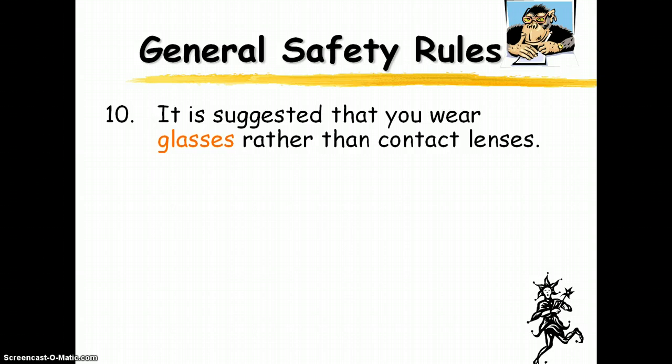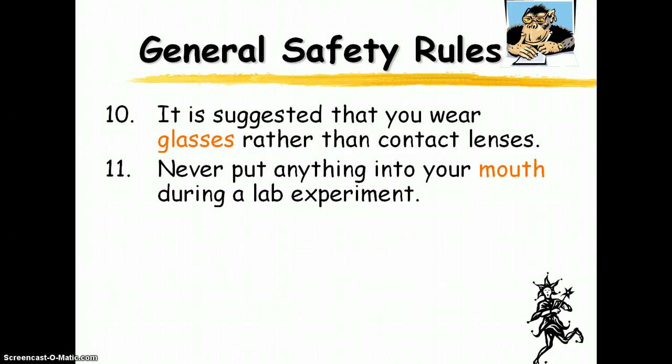Notice it says it's suggested you wear glasses — I'm not telling you to go out and buy glasses. If you wear contact lenses, we're going to be wearing safety goggles in class, but it's always good to recommend glasses. Don't put anything in your mouth during the lab — nothing. Even if it looks clean, even if we're working with water and you think you'd drink it out of a beaker, think again. Nothing should ever go in your mouth; you should never eat or drink anything from the lab.